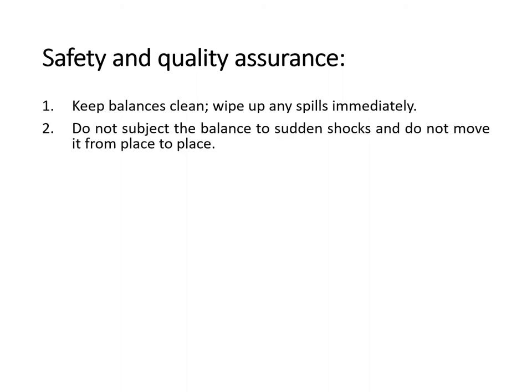For the safety and quality assurance of our laboratory balance, we have to remember the following. First, keep balances clean at all times and wipe up any spills immediately. Second, do not subject the balance to sudden shocks and do not move it from place to place. You should designate a specific area inside the laboratory where you are going to place the balance, and people should go there to do the weighing to avoid transferring the balance from one place to another.